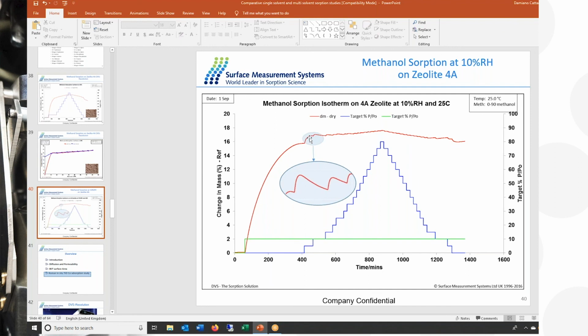So it could potentially be due to an exchange. It will need to be proven, probably by a more advanced spectroscopy study on the sample itself, to see if we are replacing molecules of water with molecules of methanol. From these data it is potentially true, but it is an assumption more than anything at this point. I want to highlight it because it's a specific phenomenon that we're seeing in some specific materials, and a more advanced study could potentially show if there is a solvent exchange happening here. But it's a good point, yes. Okay, thanks, Damiano, and thanks as well, Judith. I hope we answered that.